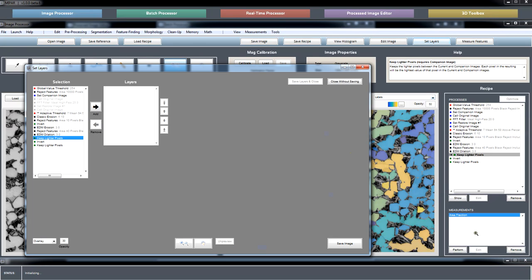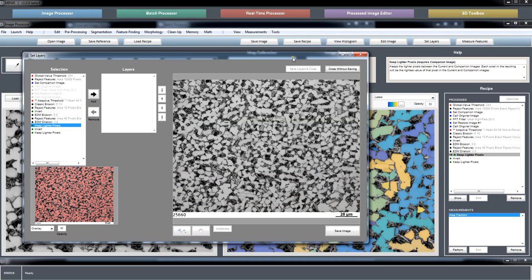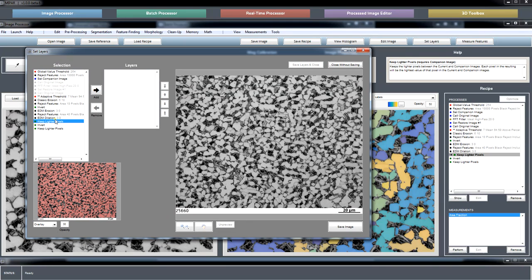But if you wanted to, say, make an area fraction measurement, even though you don't really need to have the primary and secondary as separate layers if you're just measuring area fraction, because the area fraction of one is going to be 100 or 1 minus the other, if you want to use percentages or not. But if you were measuring some other metric, like size of all of the features in each of the layers, you might want to assign those steps as different layers.